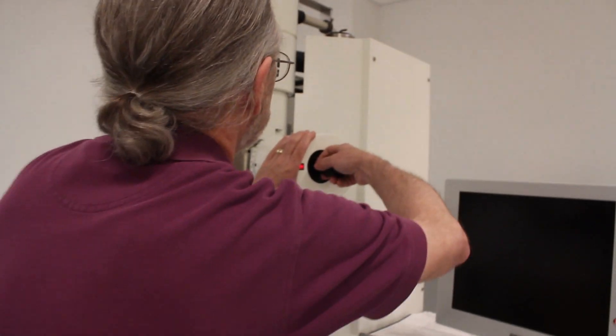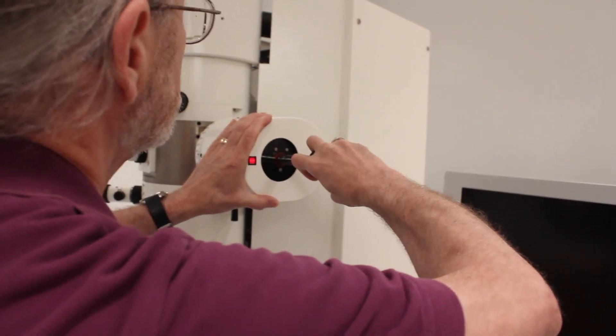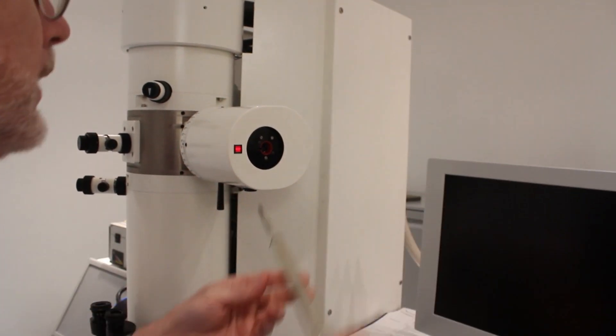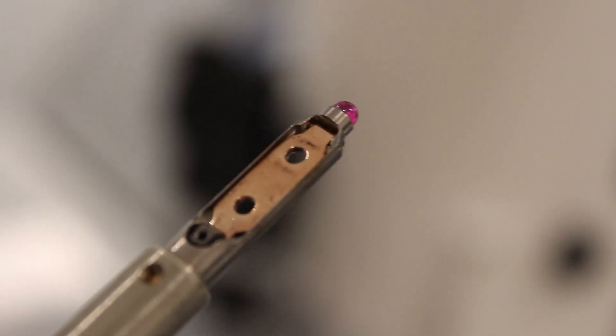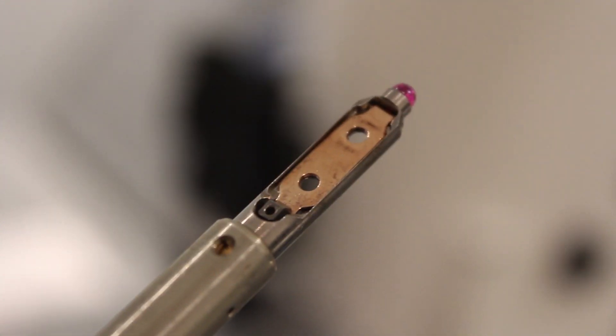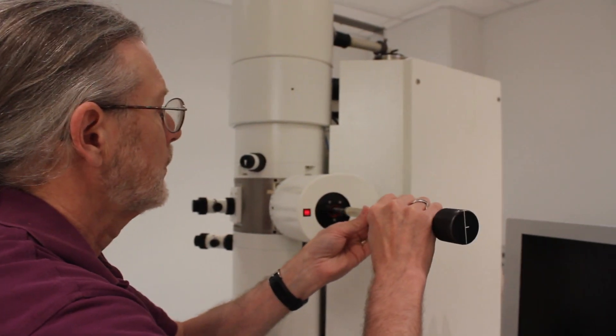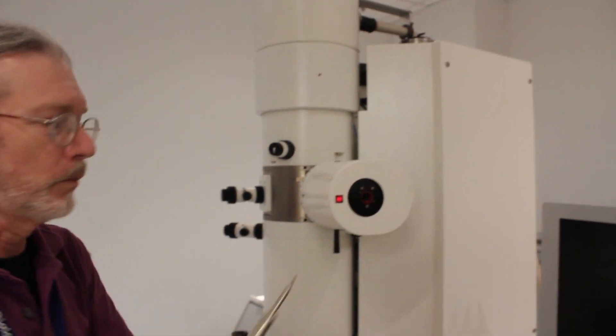I can show you where. That's a pretty fancy way to take things in and out. Yes, that's an airlock right there because we never vent this column. So it just goes right there in the tip? Yep. It fits behind that little copper plate. And so it has to index in there mechanically in a very accurate fashion.